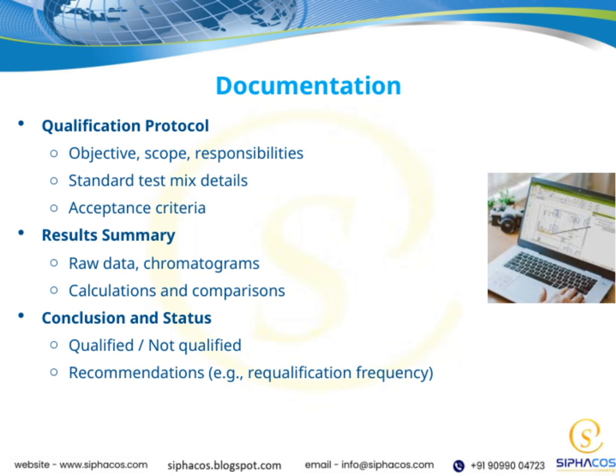Moving on, the conclusion and status tell us whether the system is qualified or not qualified based on the data. If needed, we also include recommendations, such as how often requalification should be performed to maintain ongoing compliance and performance. All these elements together ensure thorough documentation, supporting a robust validation process that aligns with overall quality and regulatory expectations.